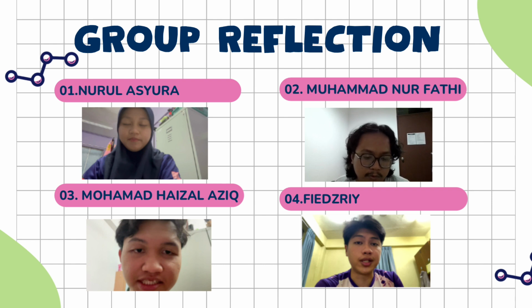Our results in the first run were some high, some low, which is very inconsistent and not following the Beer-Lambert law. As we know, according to the Beer-Lambert law, as concentration increases, the absorbance increases. And in the second run of our experiment, we got the result we needed.